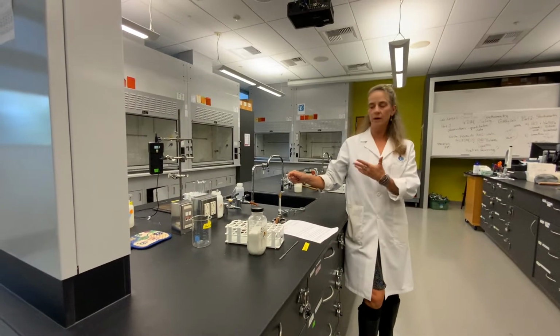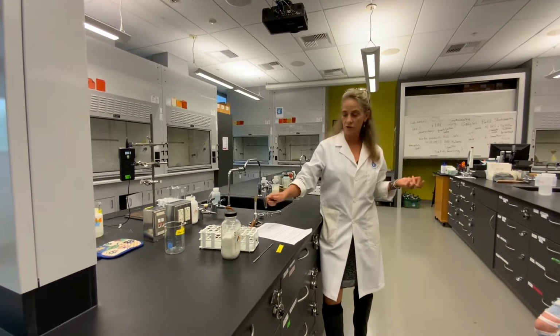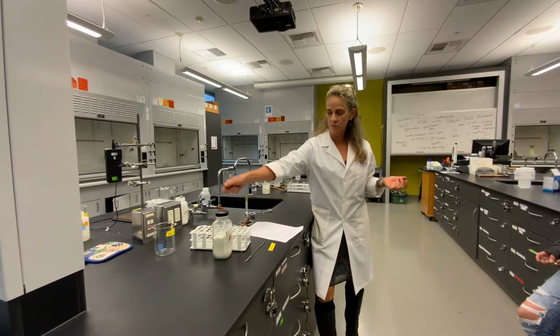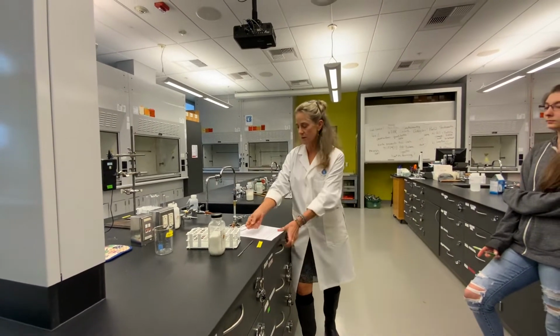And please look for what else you see in here. You'll see some liquid in here, so just mind that. So take a good observation. Okay, those test tubes can just go in the waste beaker. Everybody got that? Okay, so that's experiment 3.